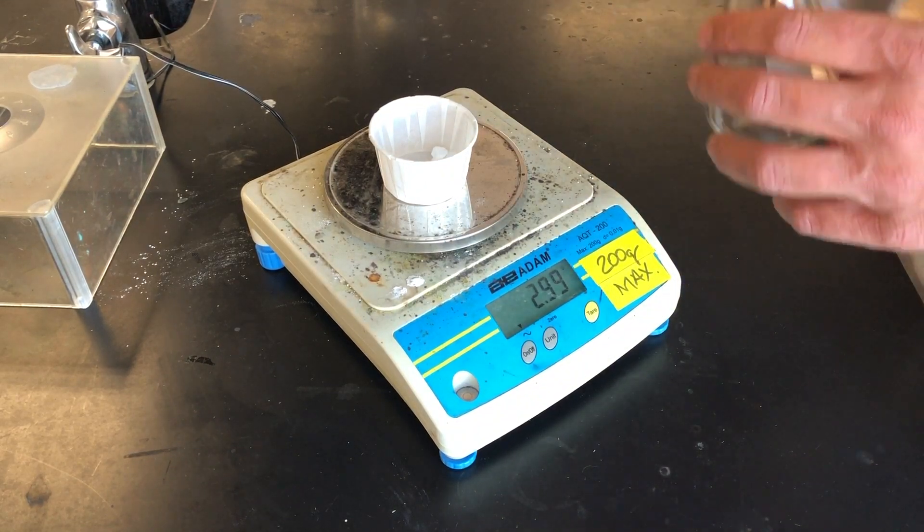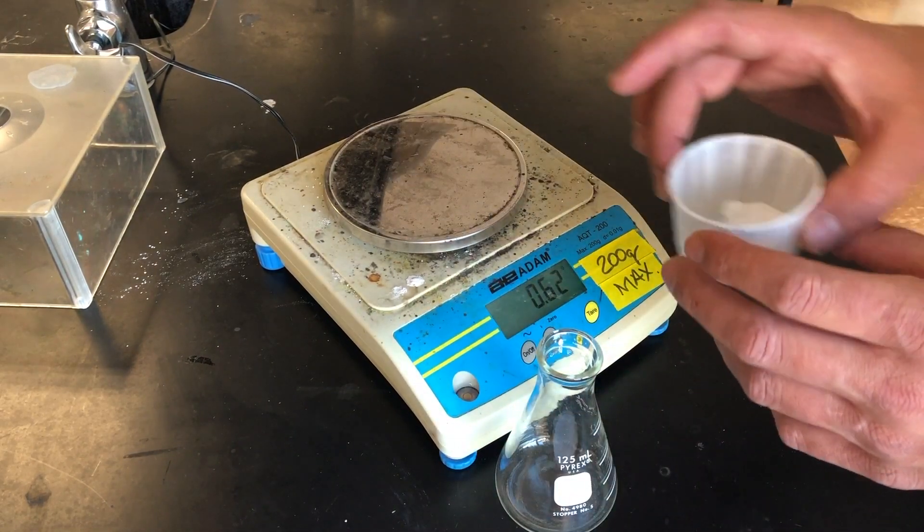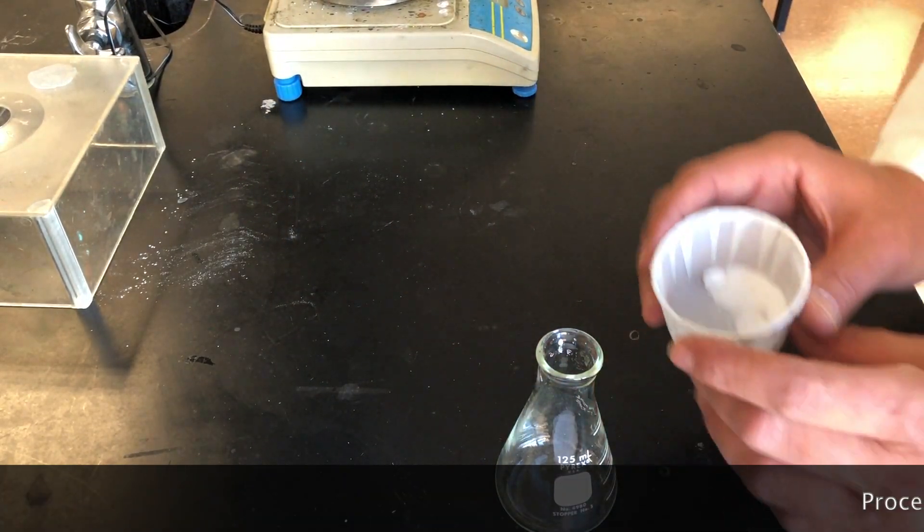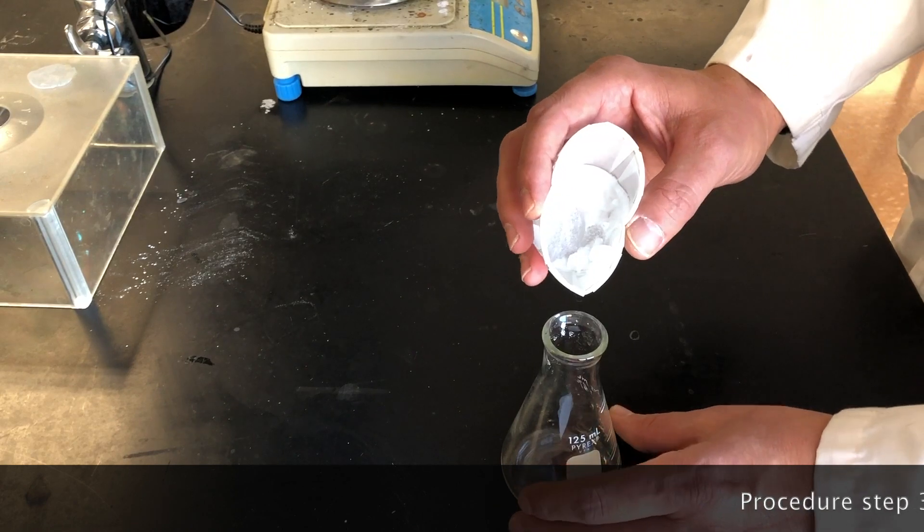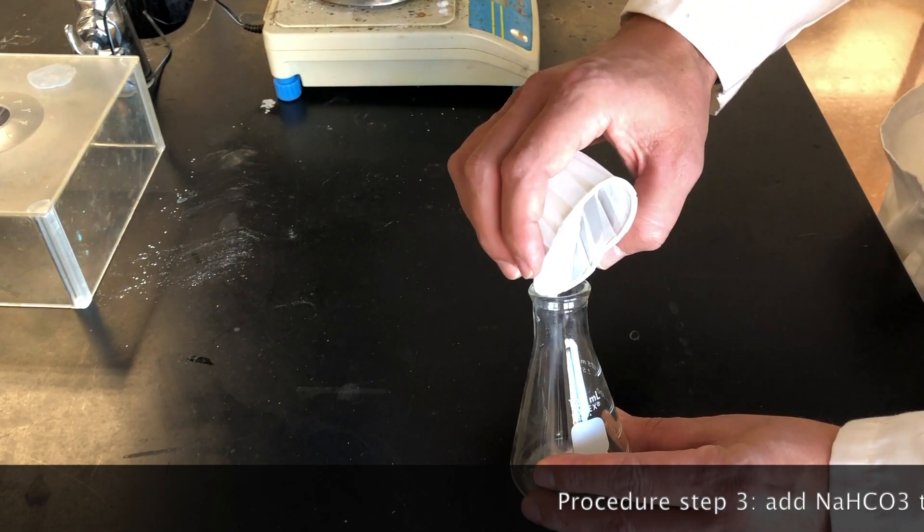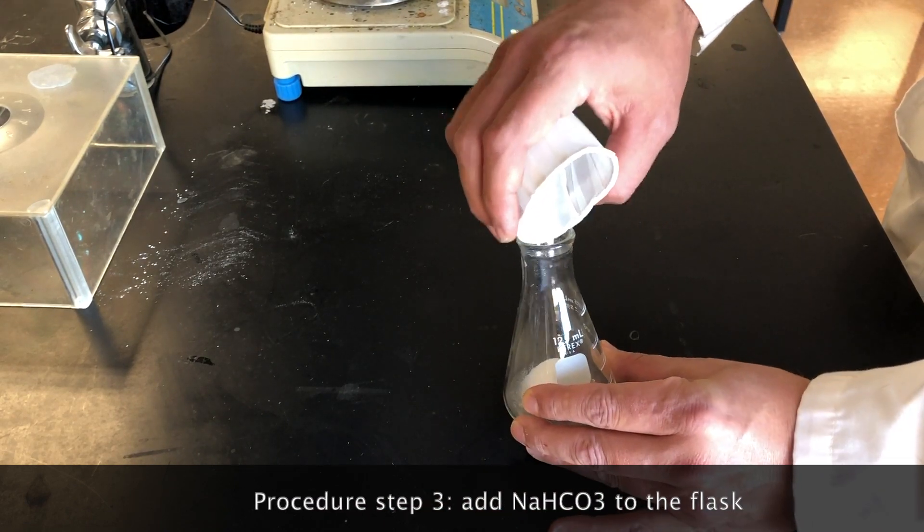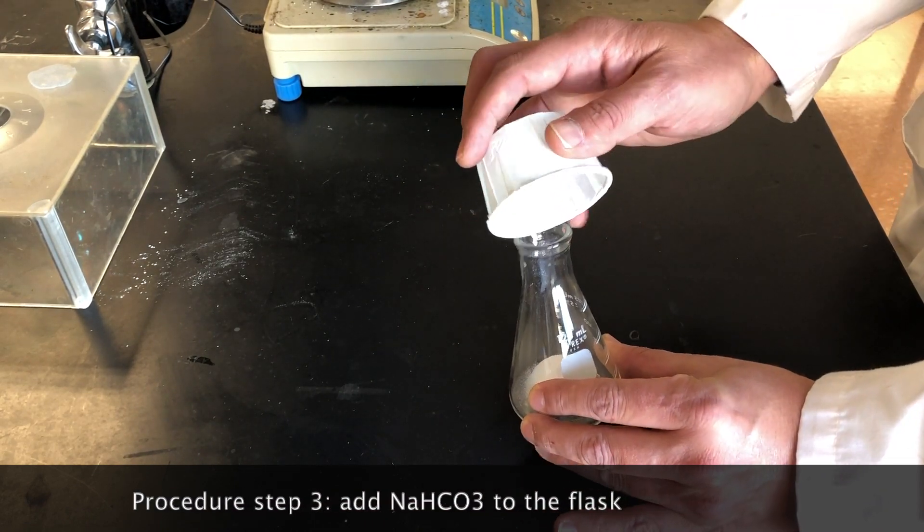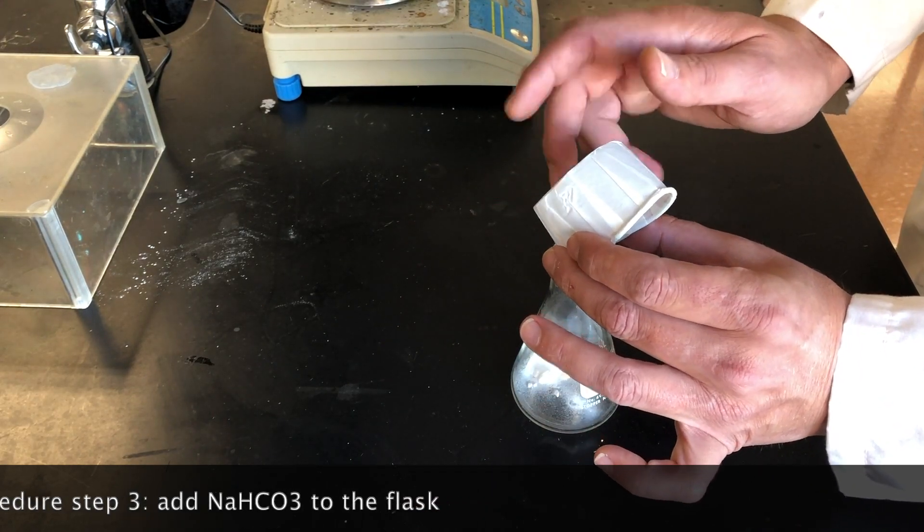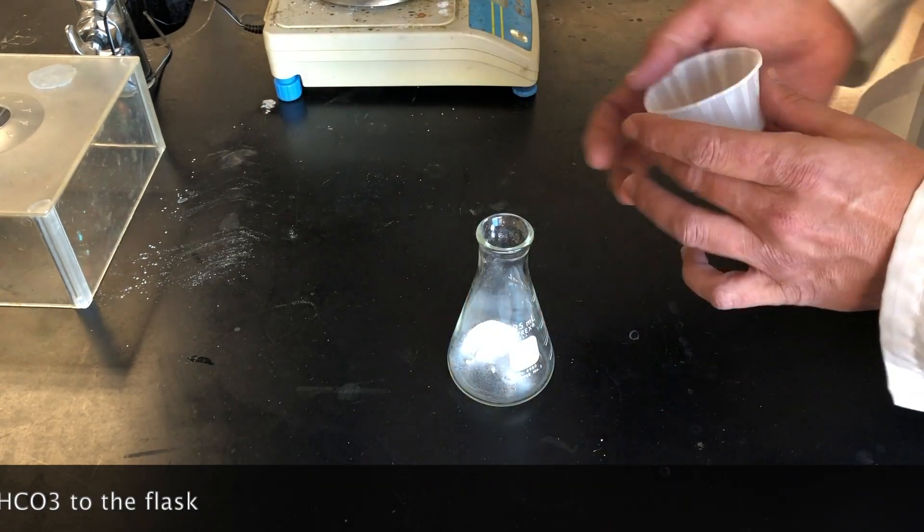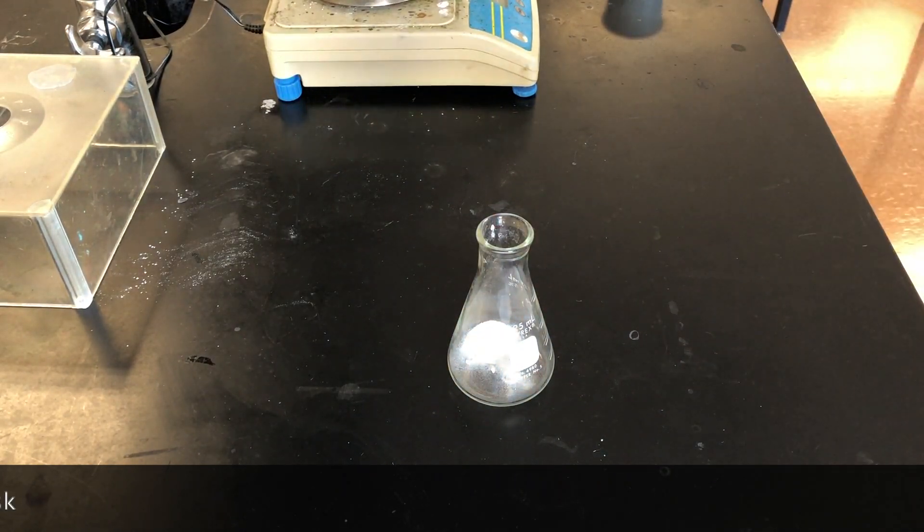We are going to take the sodium bicarbonate, and we are going to put it into our Erlenmeyer flask, making sure that we don't spill any, so all of the sodium bicarbonate goes into the flask. Now we're ready to perform the chemical reaction.